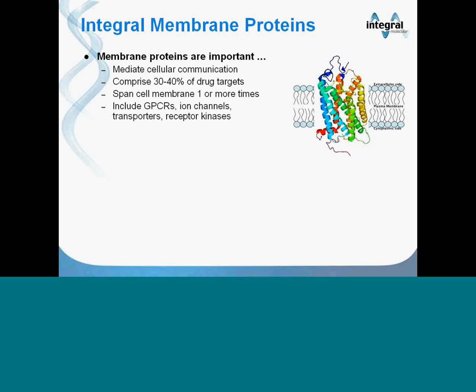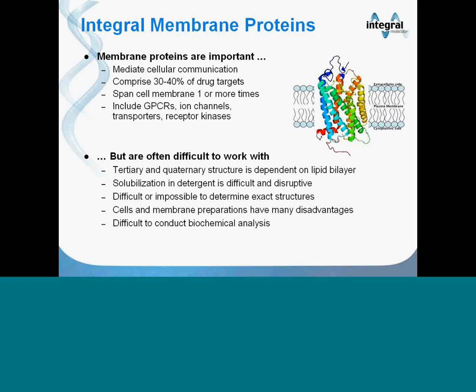At Integral Molecular, our focus is on membrane proteins and developing technologies to simplify studying membrane proteins. And today, I'm going to talk about two technologies. The first involves the use of biosensors to study membrane proteins. And for this, we use one of our technologies, which is the Lipoparticle. And Lipoparticles are virus-like particles that we can engineer to contain a membrane protein of interest.